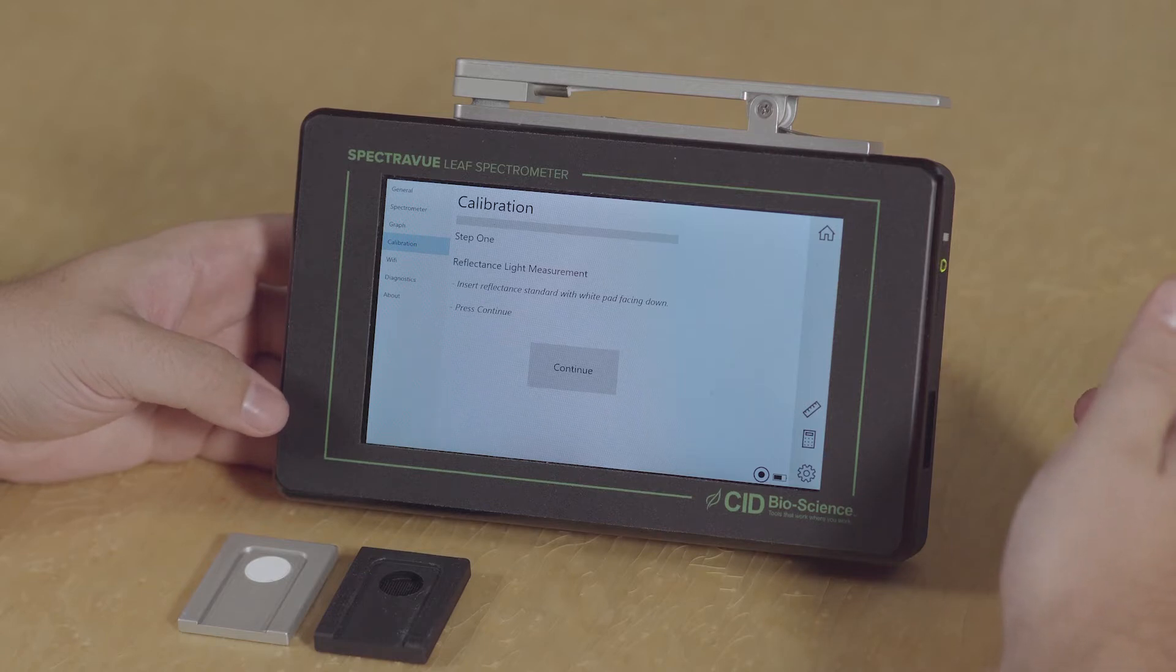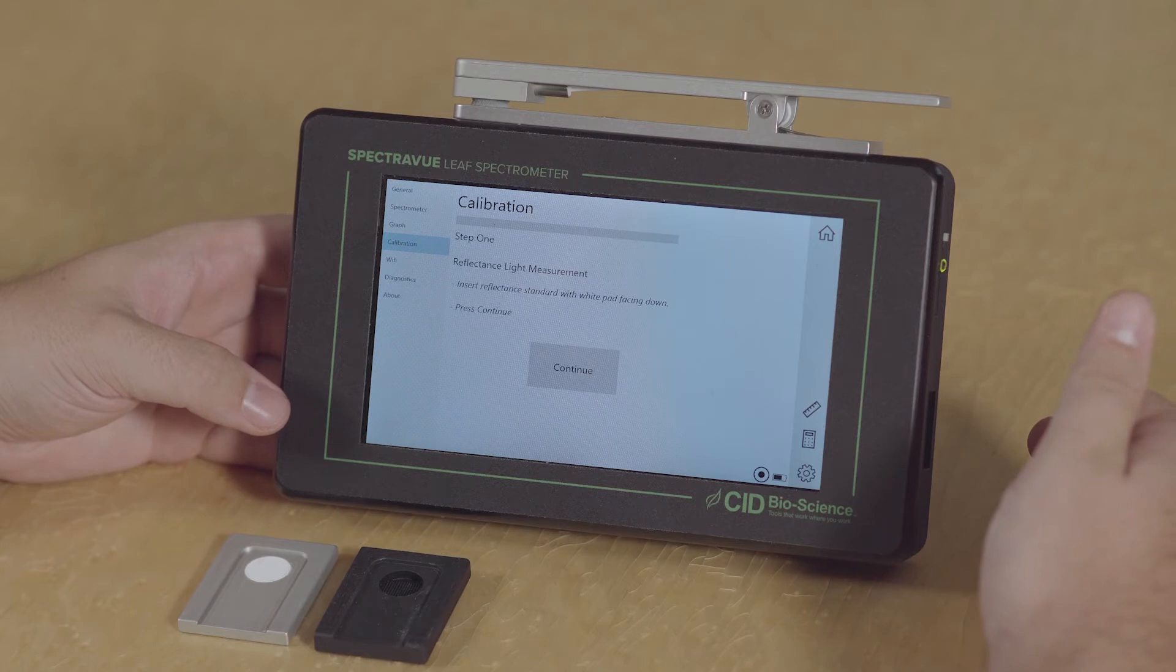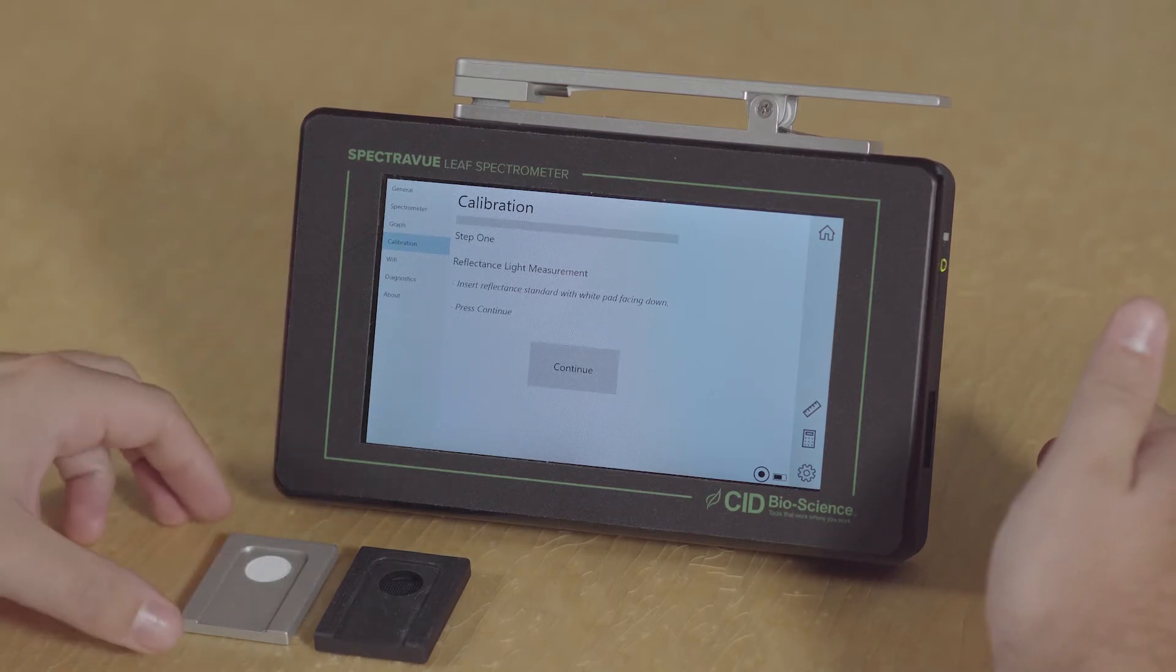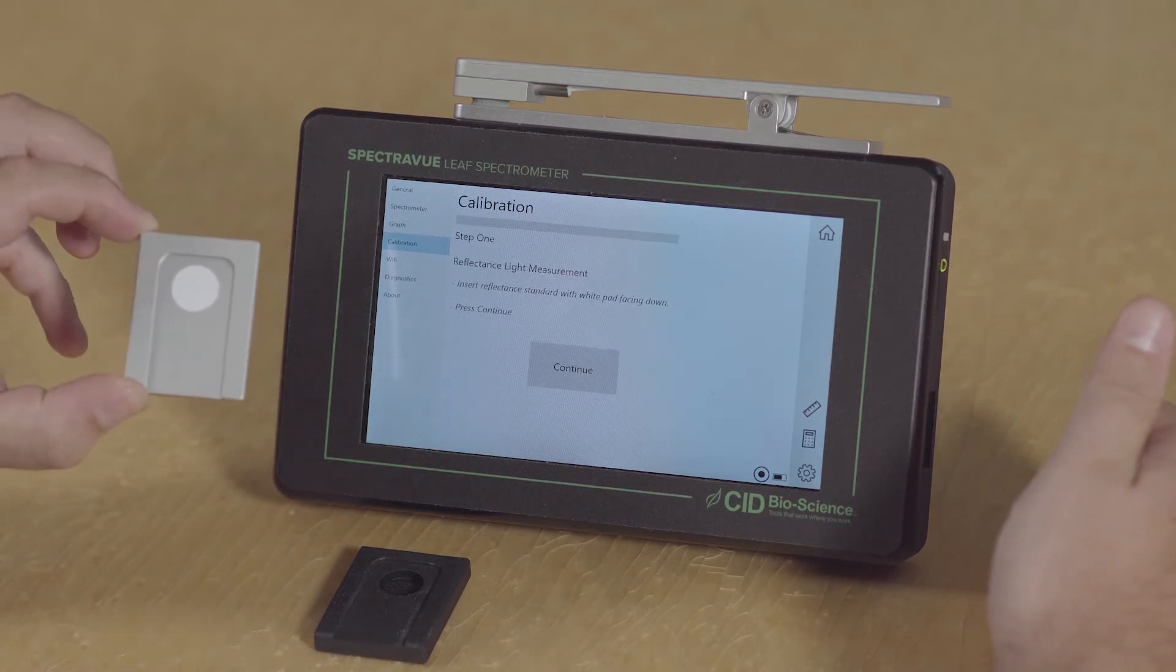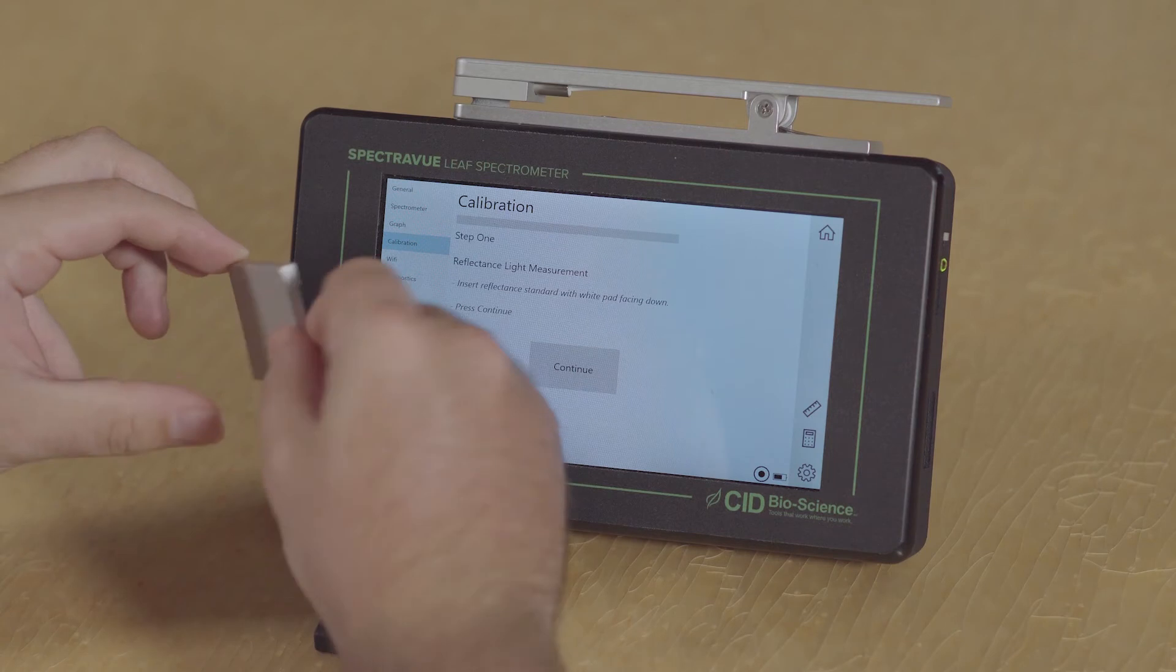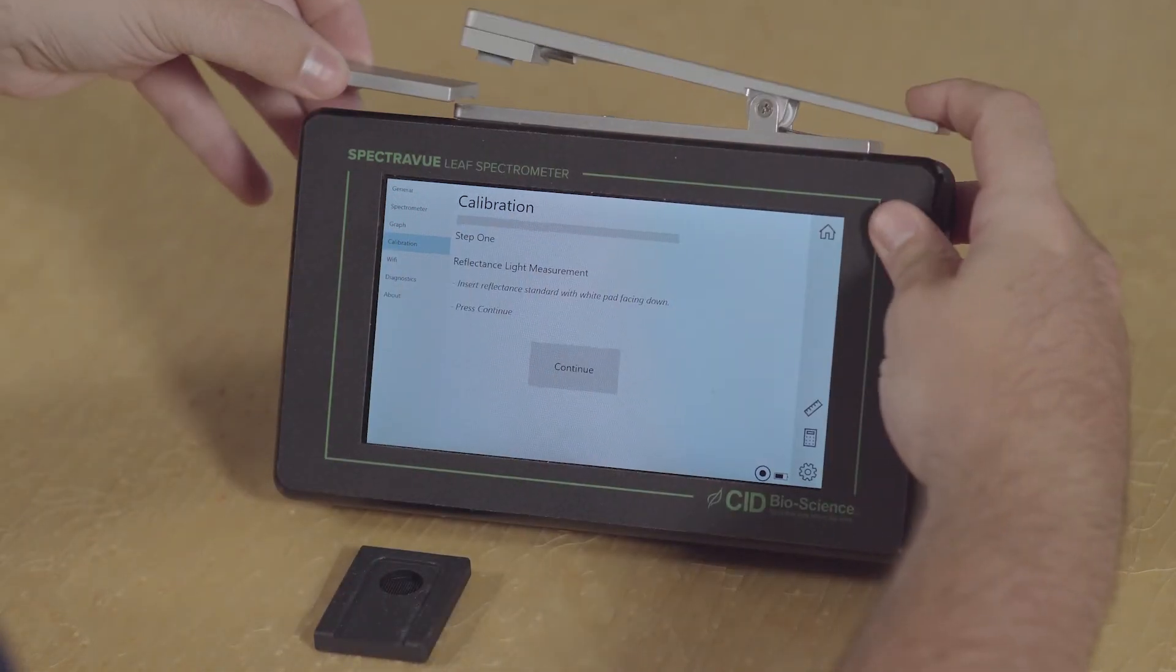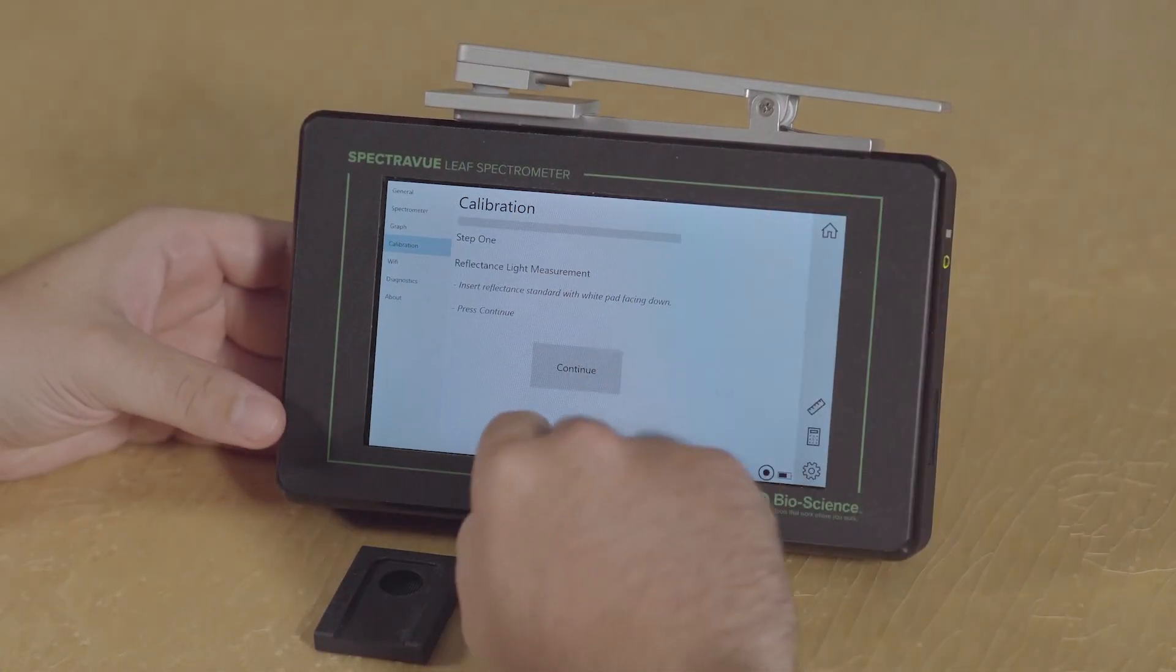So the first step in this process is to insert the reflectance standard with the white pad facing down. This is our light reflectance standard, and we're going to insert it facing down on the instrument and click continue.